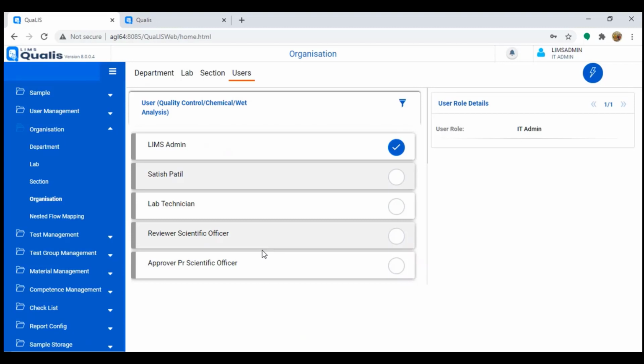We have a registration screen, which we keep open for all people, just as a view-only skeleton. They can see everything, but while working, they can work only on the activities pending for their area. That's how it works, right? So that is the use of department.